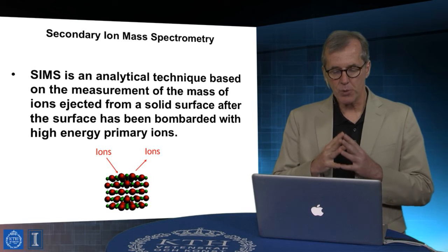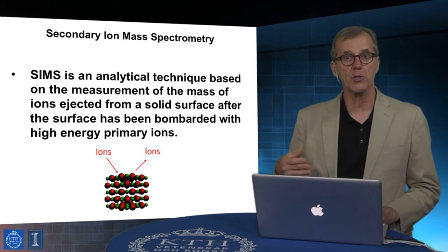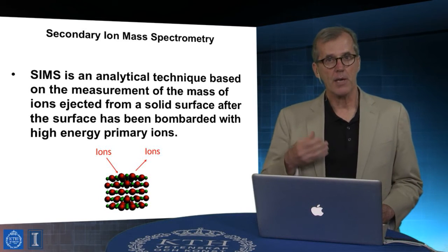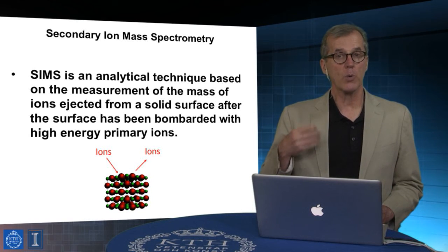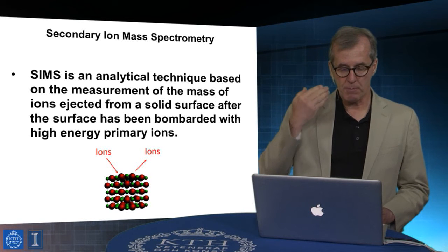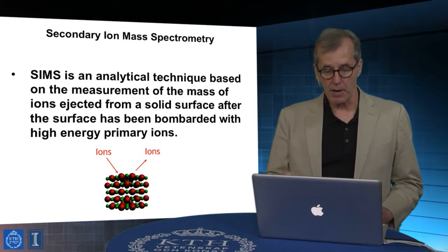In this particular case, we're using an ion beam to do those same fundamental transformations of a sample, but we're also using it as an excitation to elicit the emission of ions, which we then measure. So in this case, we impinge ions on a sample and then measure ions ejected by it.